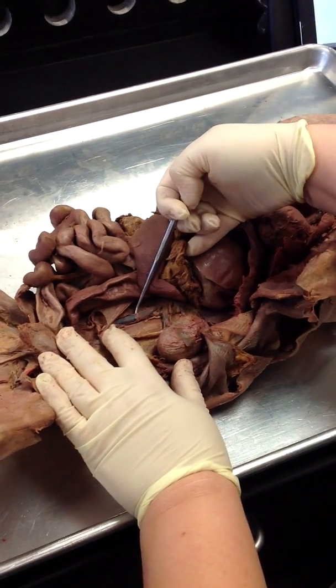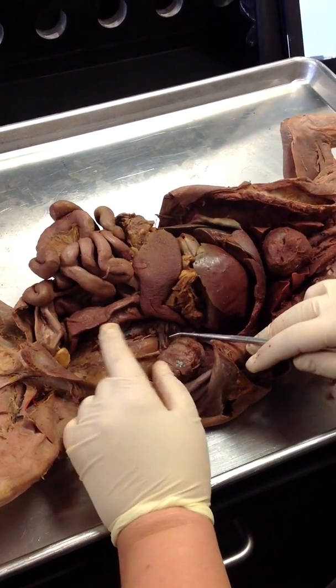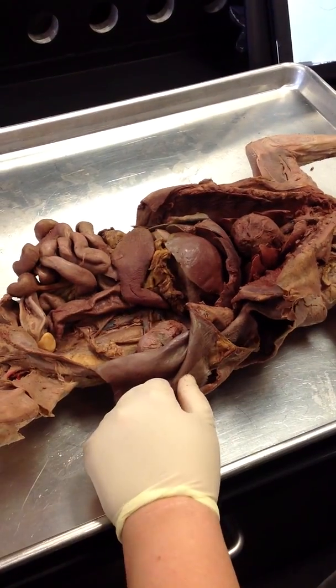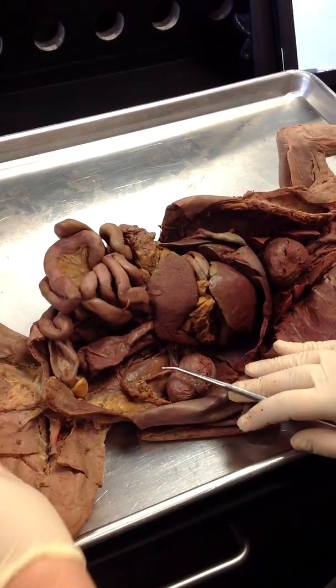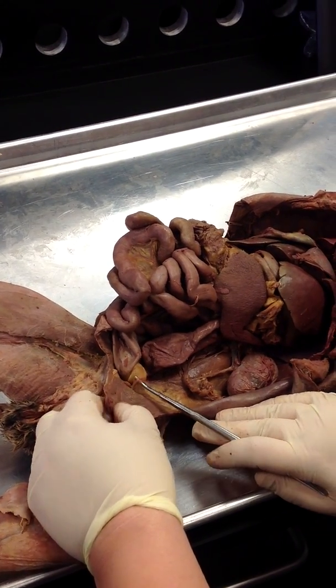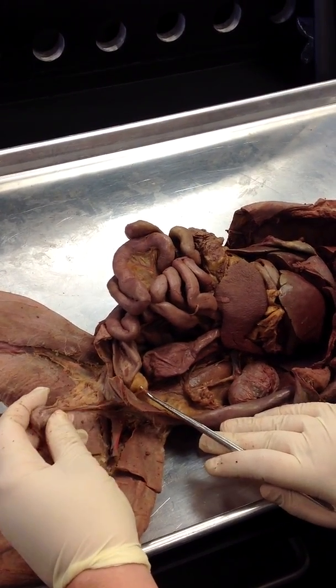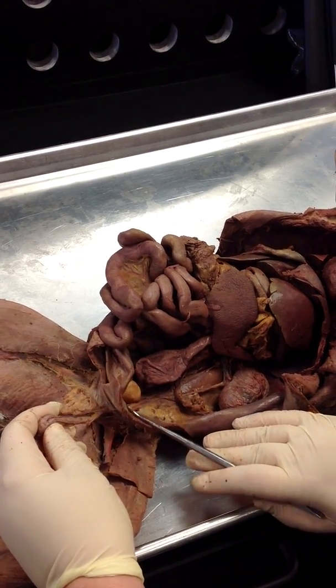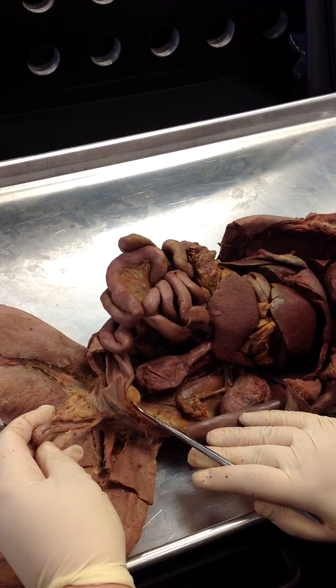And then below the heart, that's easy for the veins, right? So you got the inferior vena cava, and then you got the renal veins, and then the gonadal veins. Which one is the gonad? Okay, they go to the gonads. So in this case, since he's male, this would be the left gonadal artery, and the left gonadal vein is next to it, even though you can barely see it. It's not very well injected, but it's right there.